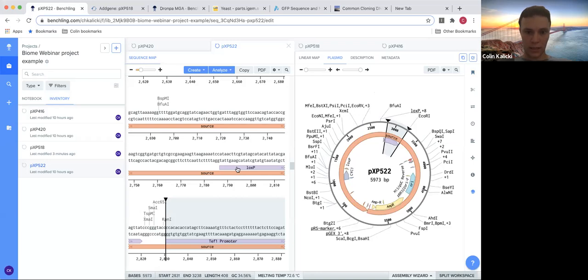Don't worry about this LoxP stuff yet. We shouldn't even worry about it. There's going to be other things in your plasmid that you may not even care to code for, just around. And sometimes it's important to use operons. If you remember Alan's thing from the first week, operons can be used to regulate gene expression. Sometimes that's important, sometimes it's not. Depending on your experiment, it's going to matter if you have those operons in there or not. So I always like to choose one, as you can see here, with a lot of operons. It gives you nice diversity, and also you can just copy and paste, and so on and so forth.